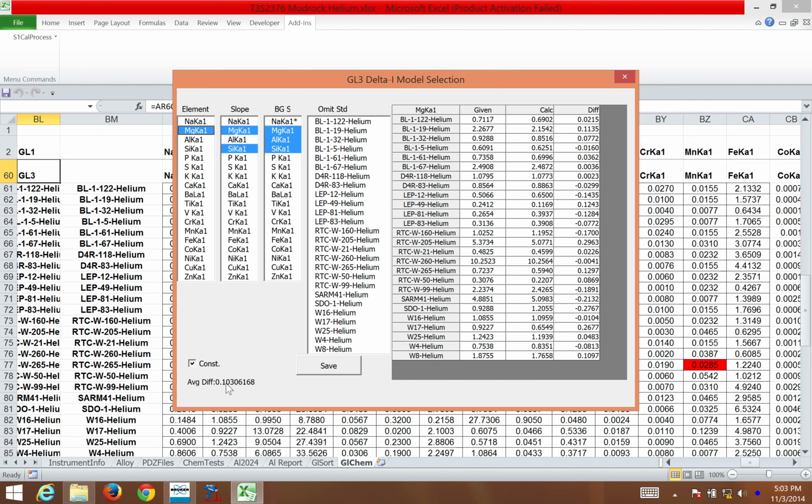This is an example where Compton normalization is critical. The only way to find out the right normalization is to look at your spectrum first and look for a place that's varying with no clear elemental overlaps. This requires a little bit of time, but trust me, it is worth it. So that emphasizes why normalization is important.